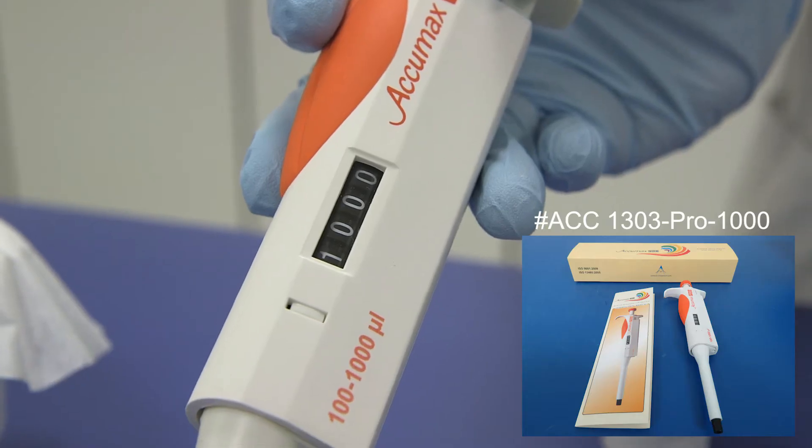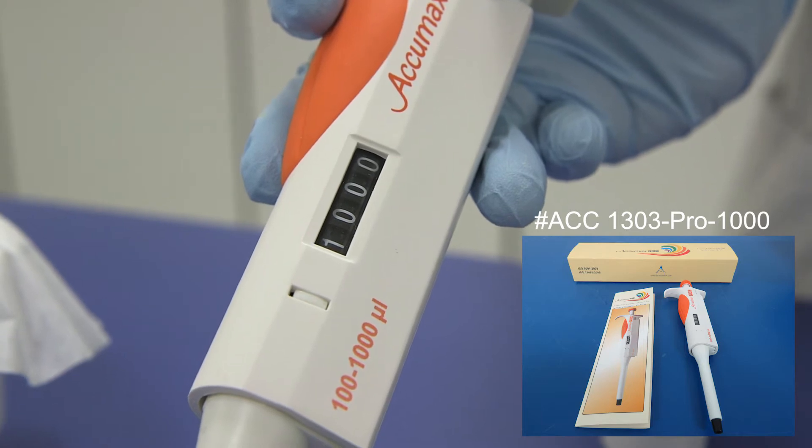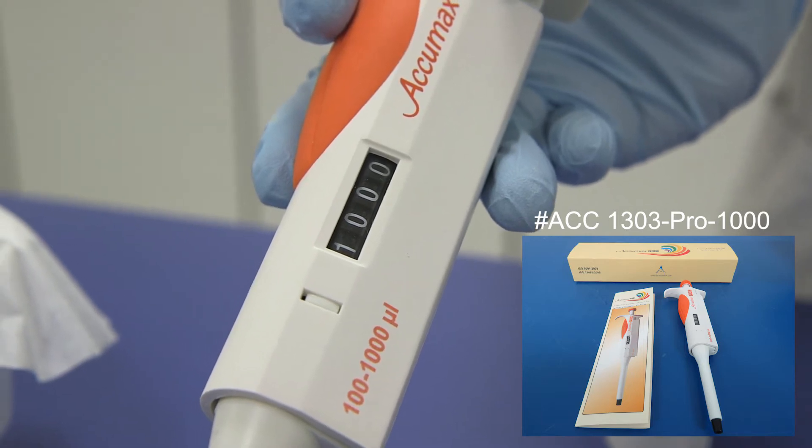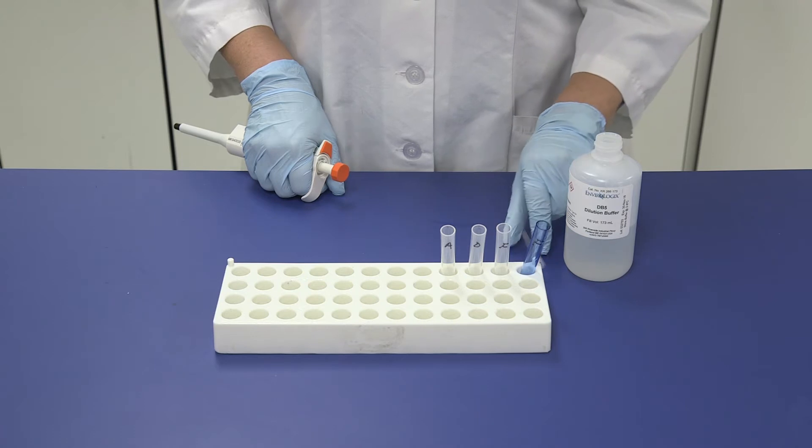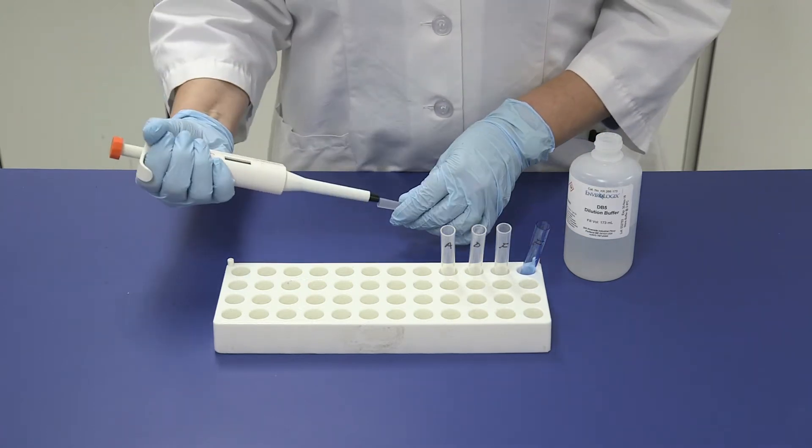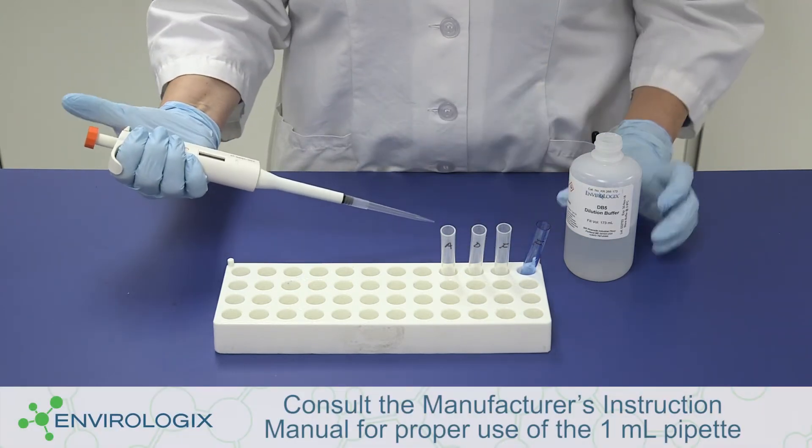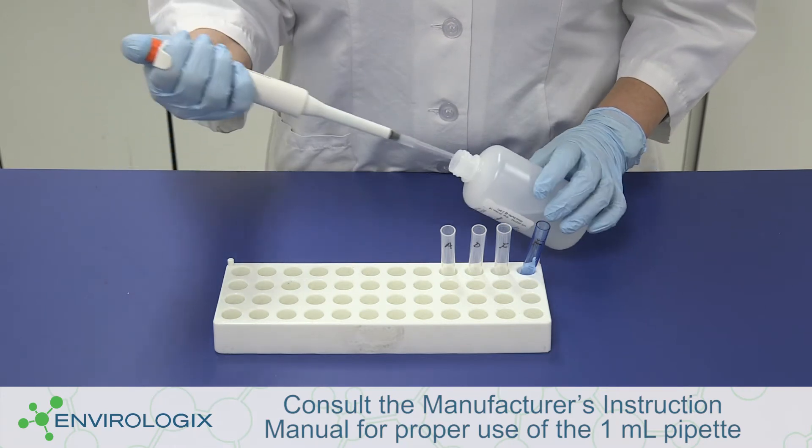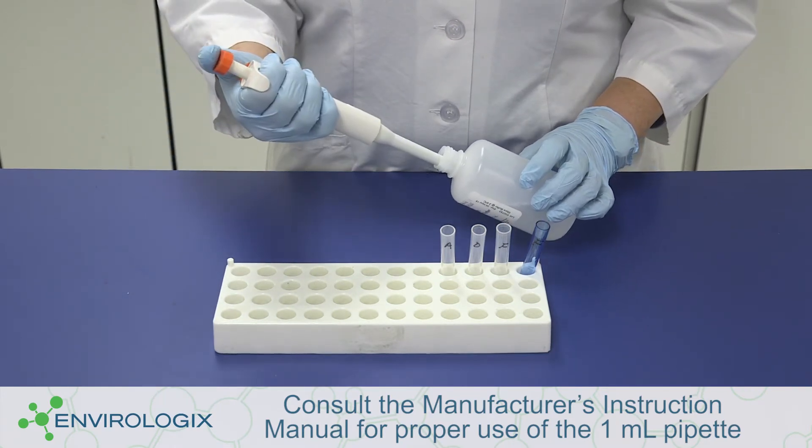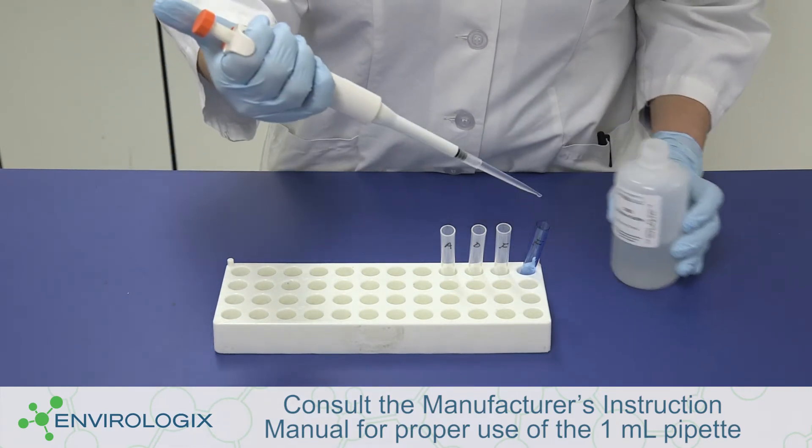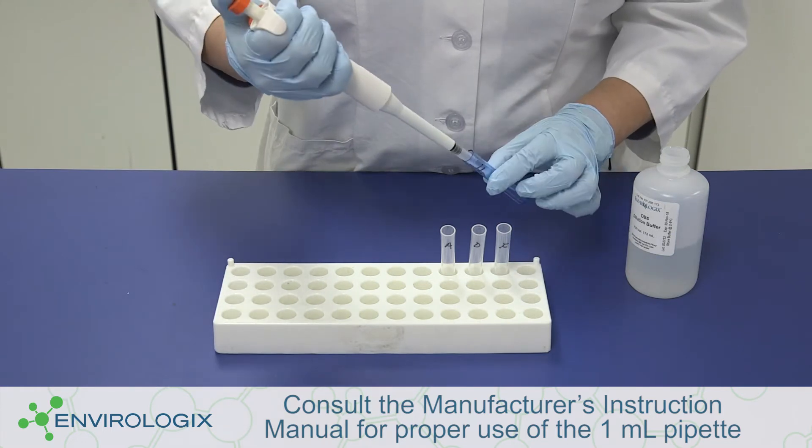Add the required amount of DB5 buffer for each tube, starting with the blue dilution tube labeled F. Place a clean tip on a large pipette set to one milliliter. Add three pipettefuls of DB5 to the blue dilution tube labeled F for a total of three milliliters of DB5.